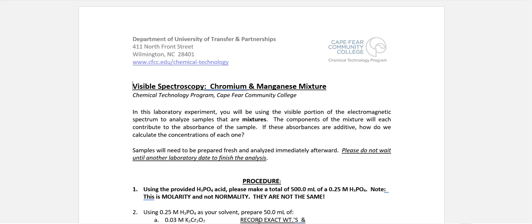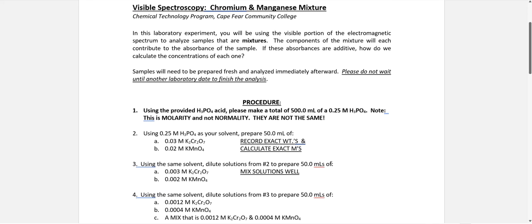So how on earth do I complete the spreadsheet now that I have the data, now that I've made and diluted everything, now that the lab tech has given me a mixture to make a known mix? It's your job to figure out what that was going to be. And after we ran it on a UV, what do I do with the numbers? There are all these weird things I need to do. So how on earth do I do it, Tracy? Well, this video is going to tell you.